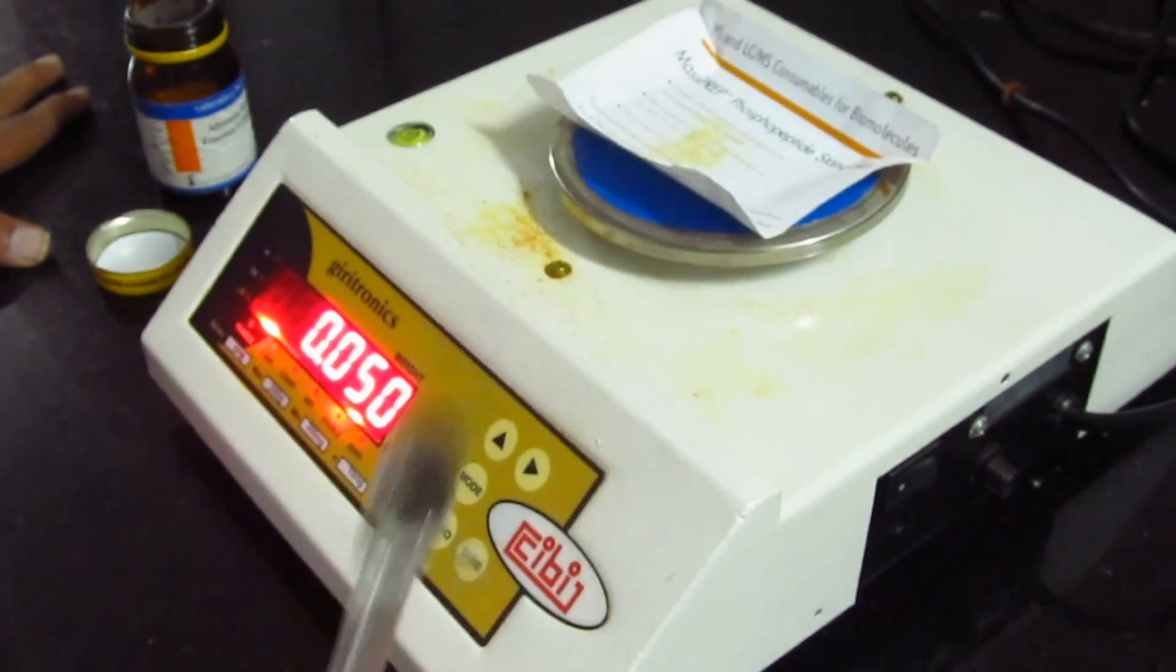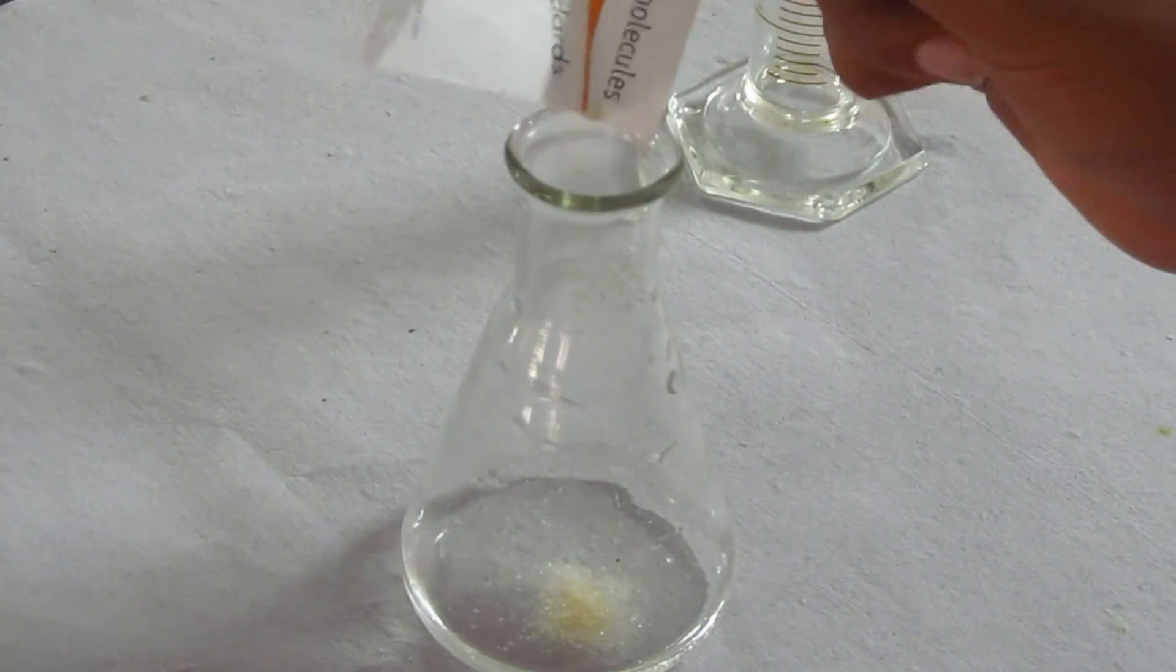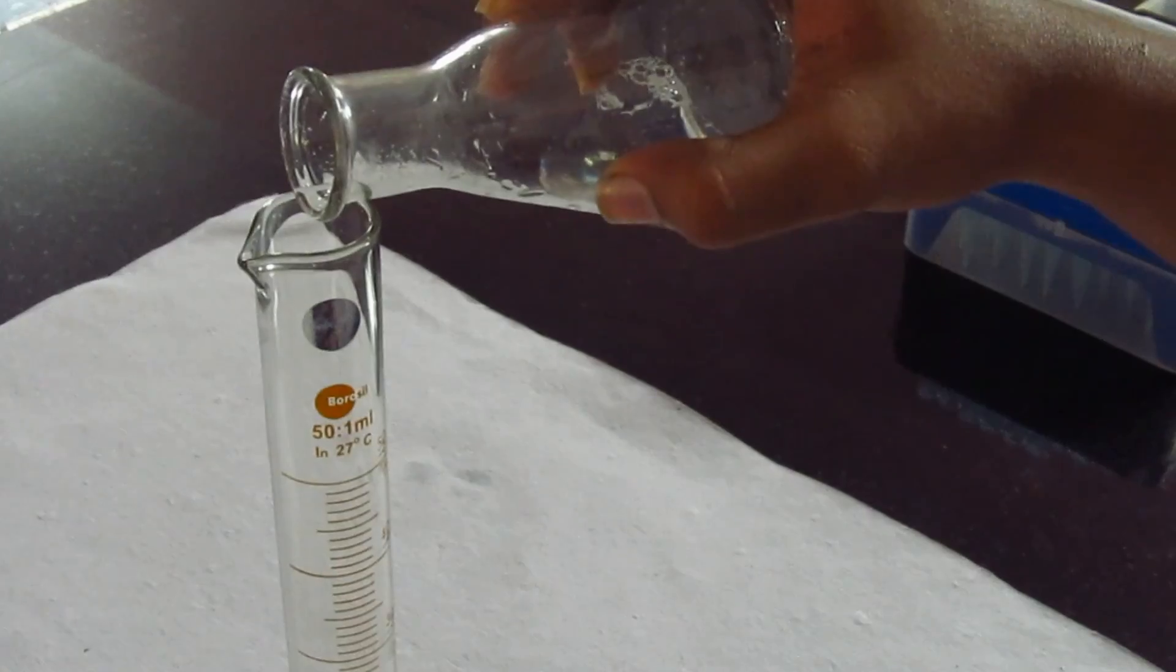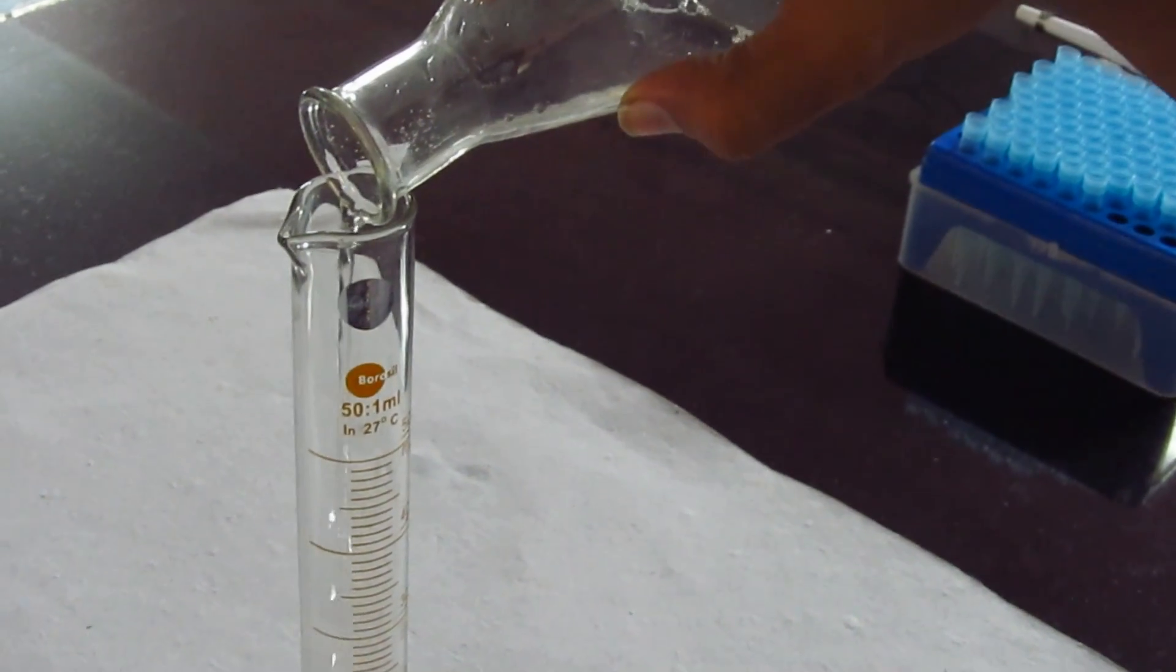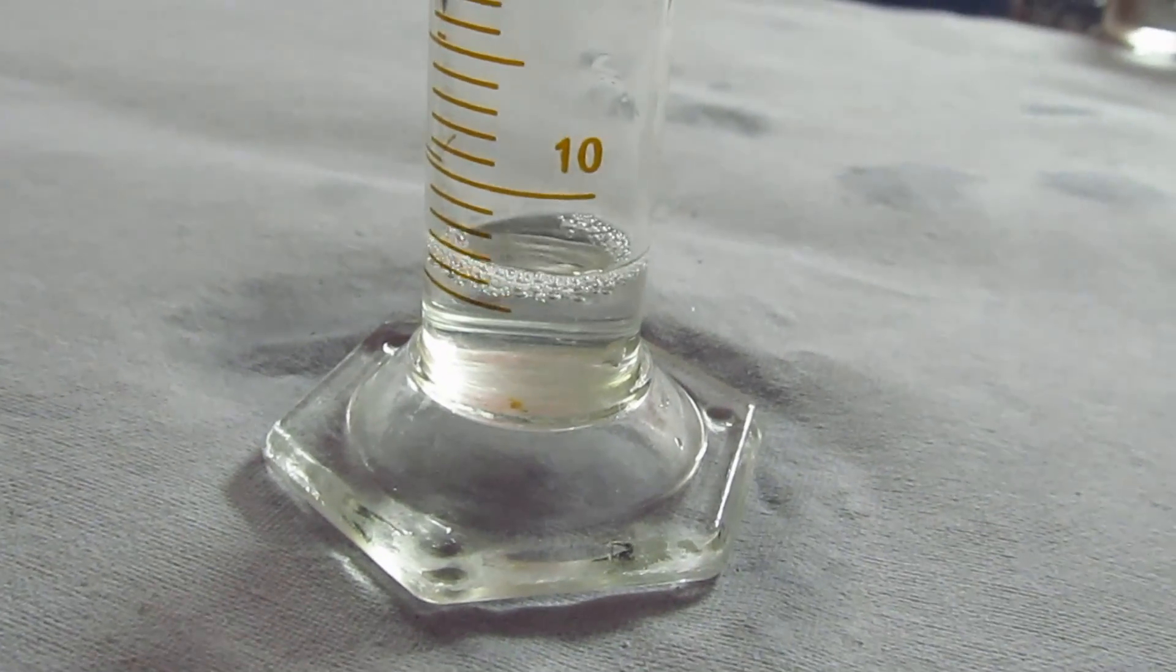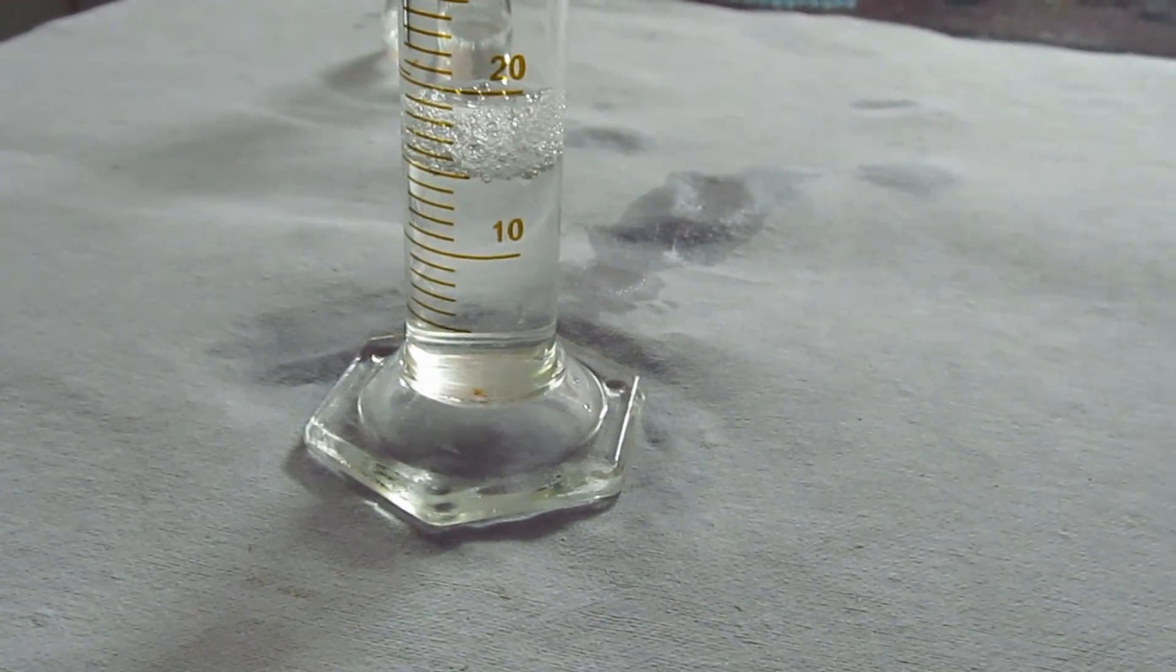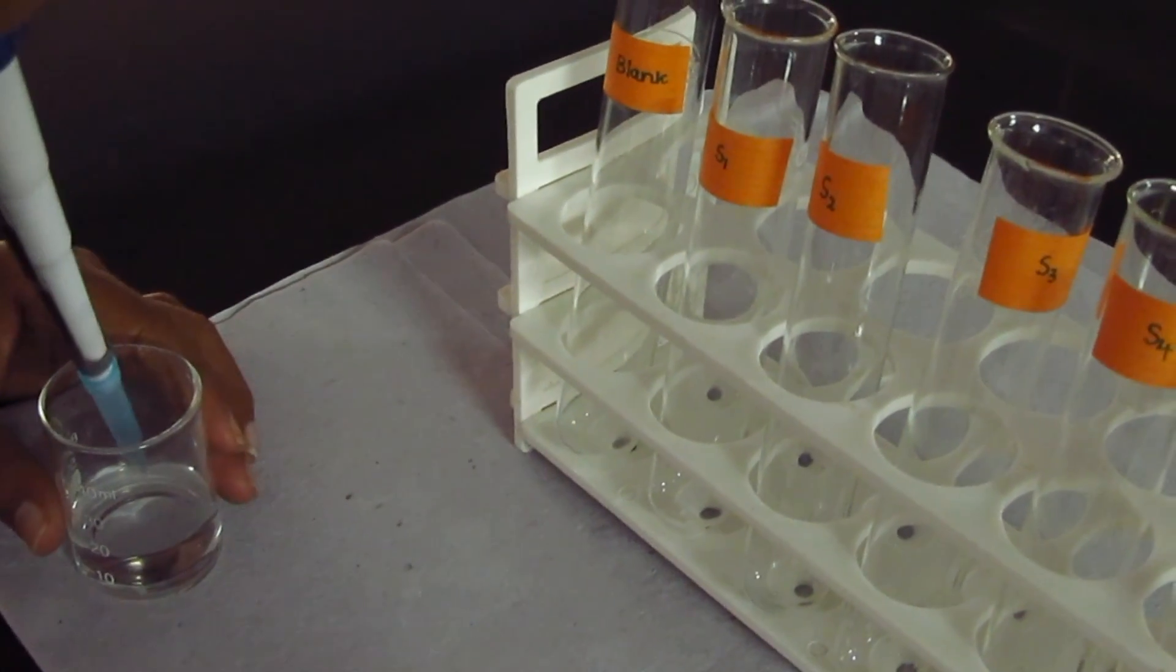Weigh 50mg of BSA and dissolve it in distilled water. After dissolving, make up the volume to 50ml using distilled water. 1ml of this solution contains 1mg of protein. Dilute 10ml of BSA stock solution to 20ml using distilled water. 1ml of this solution contains 500μg of protein. Use this as a working standard.